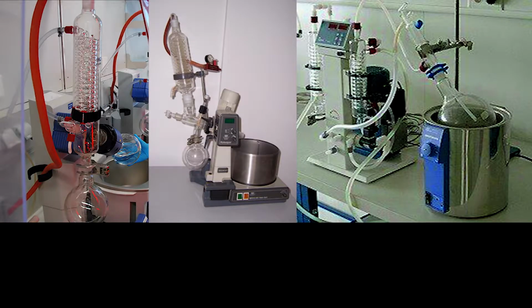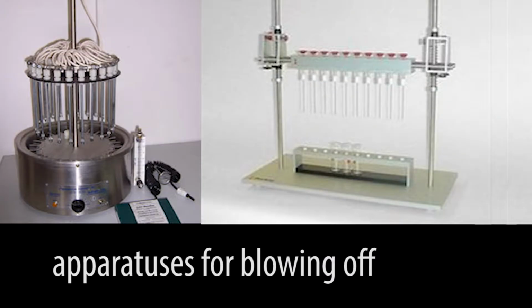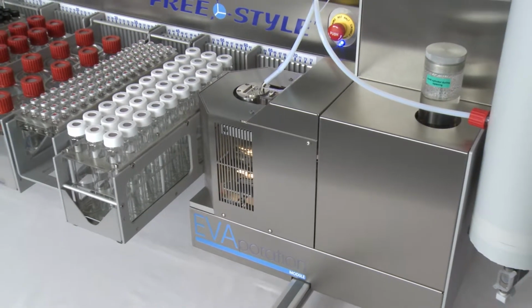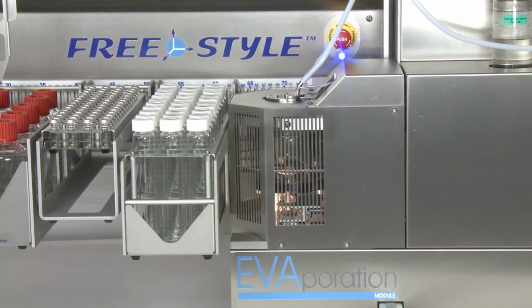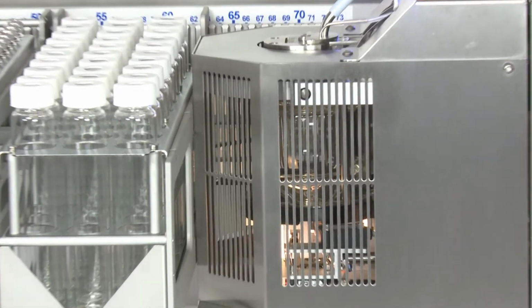The traditional ways of evaporation include rotary evaporators and apparatuses for blowing off with nitrogen. The new FREESTYLE system integrates both options and is far more environmentally friendly by means of controlled solvent recovery. In this video, we shall demonstrate the FREESTYLE Basic with the evaporation module.